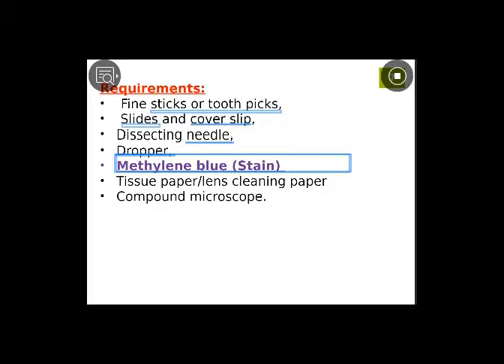We cannot see them in the microscope unless we give them some color. So if in the exam I ask you what is the stain we use in the cheek cell experiment, you will say methylene blue. Methylene blue is the name of the sabgha. You understand this?